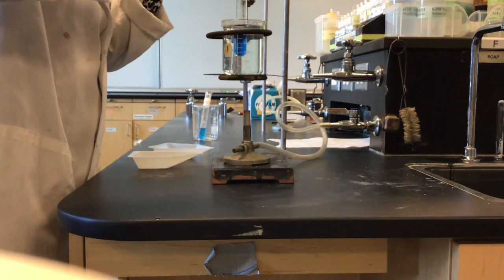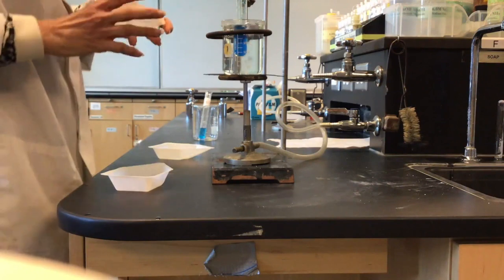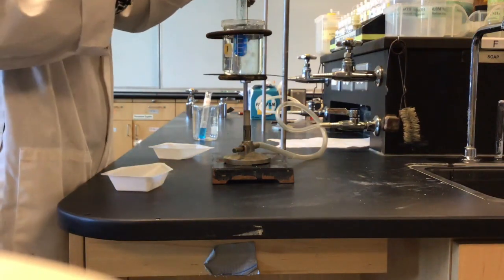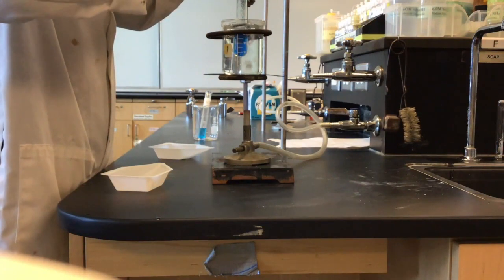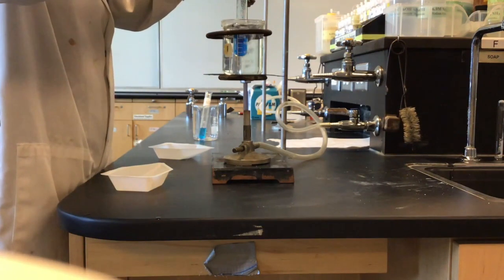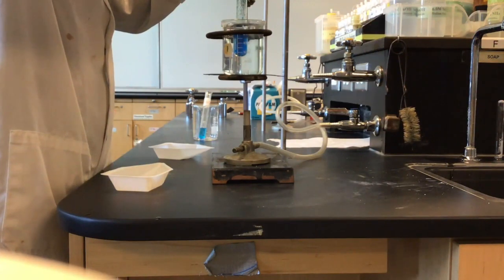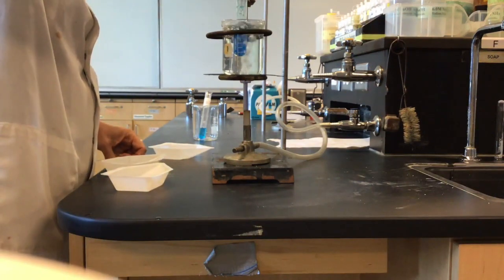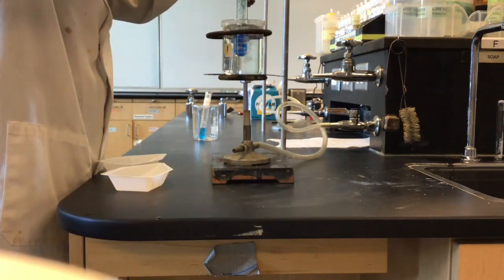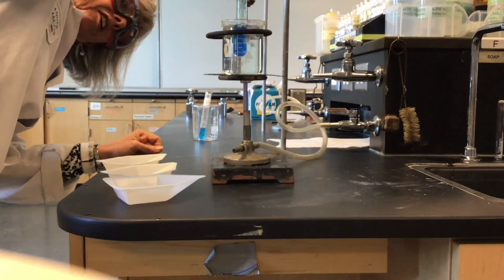This is number 12. 13. 14. And I think we've gotten to the point where it is no longer dissolving.